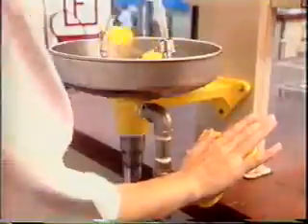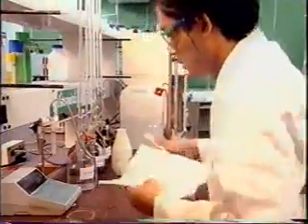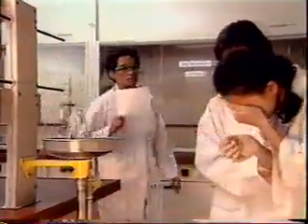If a liquid gets into your eyes, the eye should be washed immediately with clean running water for at least 10 minutes. Move the eyeballs so that all chemicals are washed out. The eyes should then be checked by a doctor. Note the name of the chemical and give it to the doctor. This information will help him to choose the correct treatment.